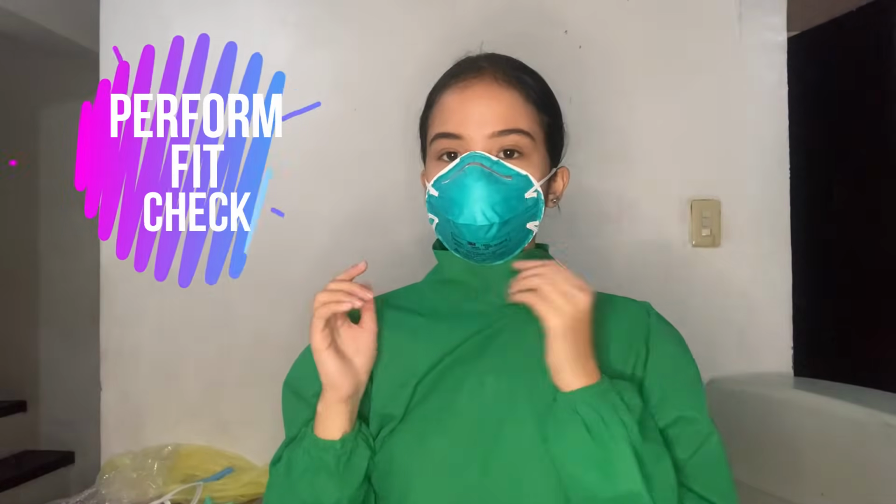Do a fit check by inhalation and expiration. Once you inhale, the mask should feel tighter and it should draw in. There should be no leaks. Once you expire, you should cup both hands around the respirator.